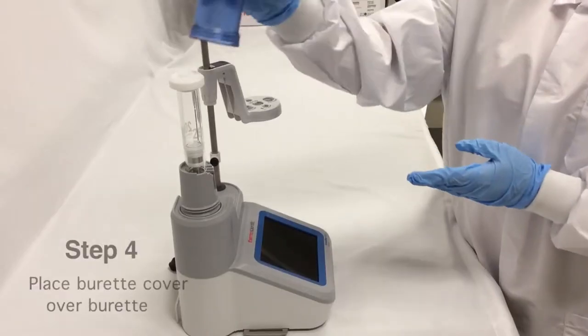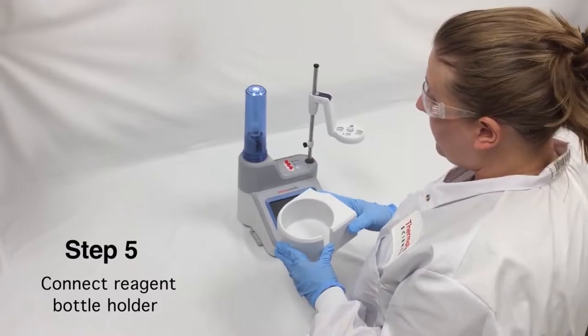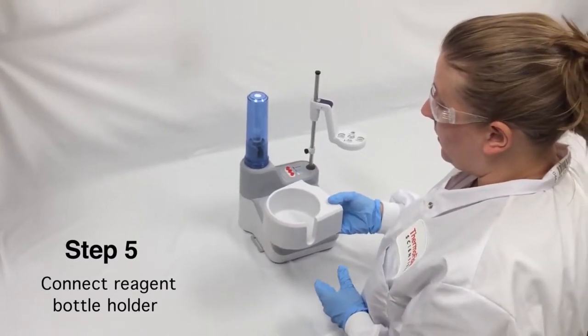Next, I'm going to put on my burette cover. Then I'm going to install my reagent bottle holder.